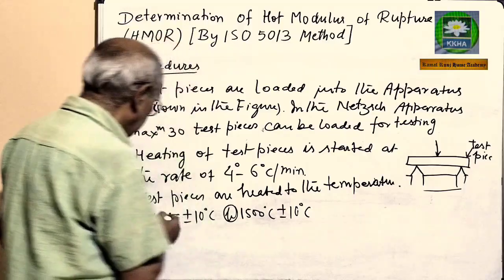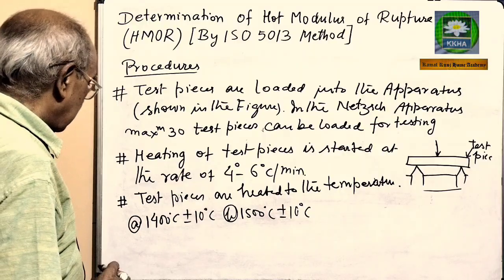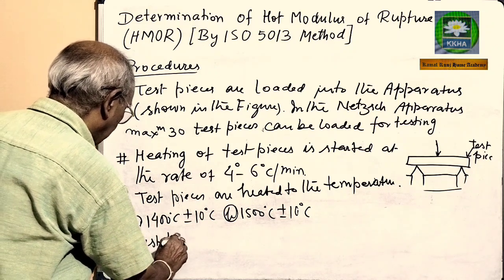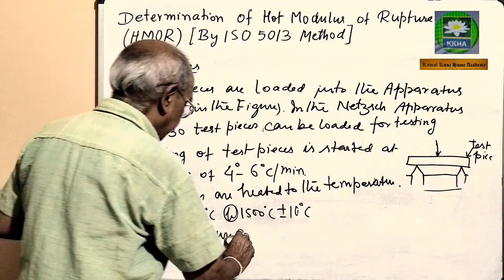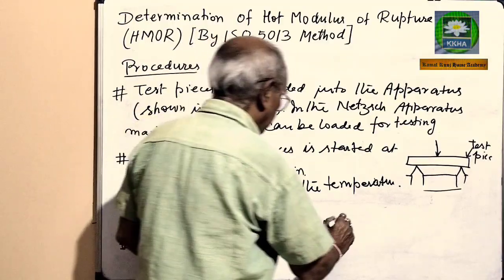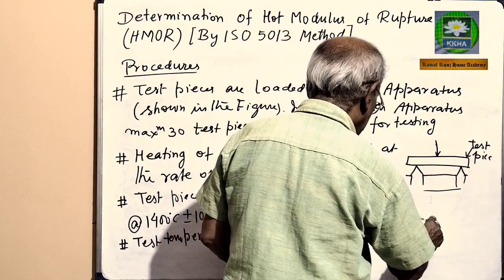Temperature is maintained for 15 to 30 minutes.